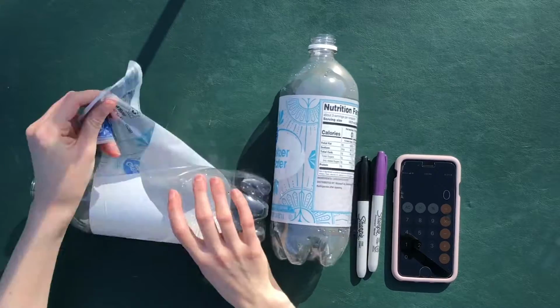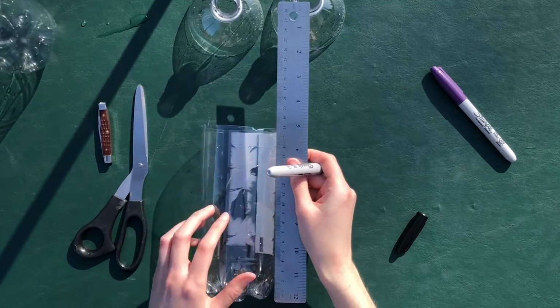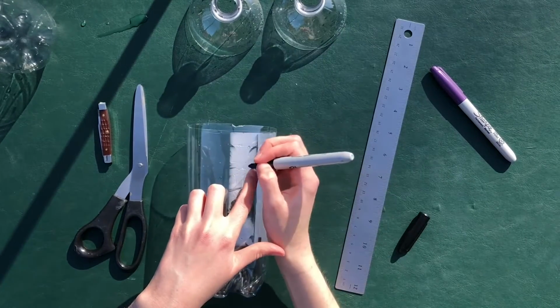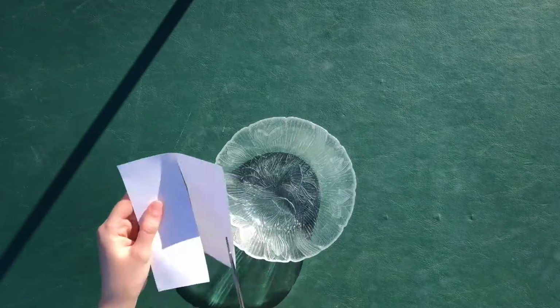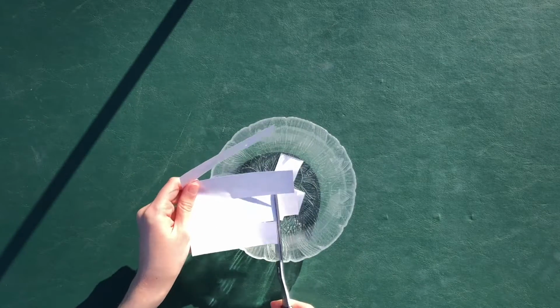First, remove the bottle wrapping so you can see clearly through the column. Then, cut off the tops of the bottles and use a ruler to mark a point about 1/4 and 3/4 of the way up from the bottom of the bottle. Next, cut up about 1/4 of paper into thin strips and place 1 egg yolk into a bowl. Set these aside for now.